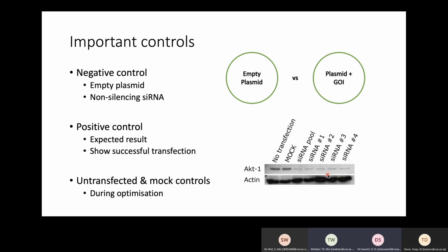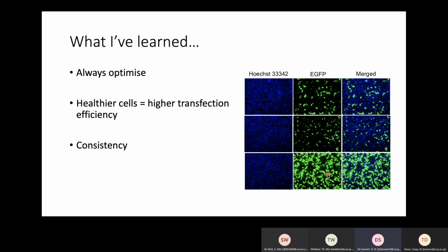I have a question. If you can go back to the slide where you show the fluorescence. This one. Yes, that one. I would like to know, and this is maybe a very silly question, but can you control the concentration of the plasmid? So what I'm trying to say, like a lower concentration would mean a lower frequency of transfection would lead to a lower signal, and then a high frequency of transfection would lead to a higher signal. Can you control the output?